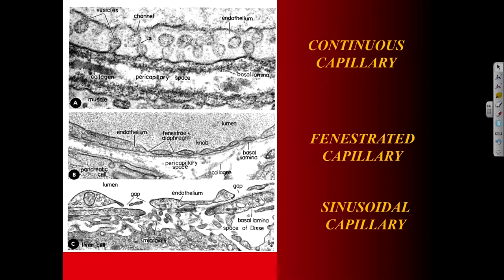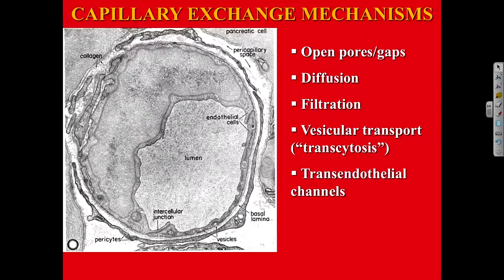Yes, basically sinusoidal capillaries in the spleen. Okay, other questions? So moving right along, here is a picture of another continuous capillary, the most common. So here's the nucleus, cytoplasm of endothelial cells, here's the lumen.